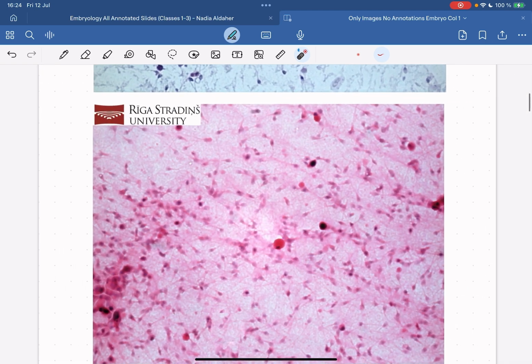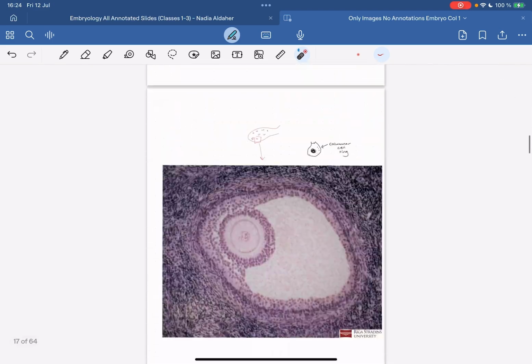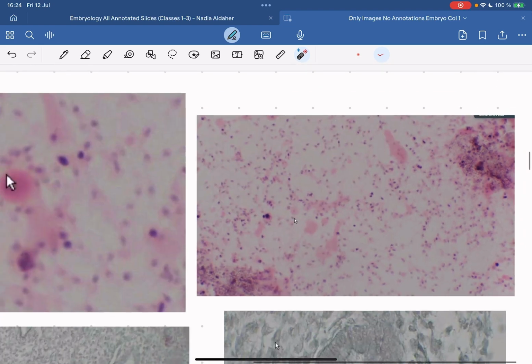Why is it difficult to identify? Because the microscope doesn't have a clear HD rendering of the slide that it's looking at, so it might just look like a cloud of nothing, like a pink cloud of absolutely nothing. You can kind of see it here. So again, this is what might appear on your colloquium, and then you might start panicking because you can't really see the very characteristic sperm shape of the spermatozoa.